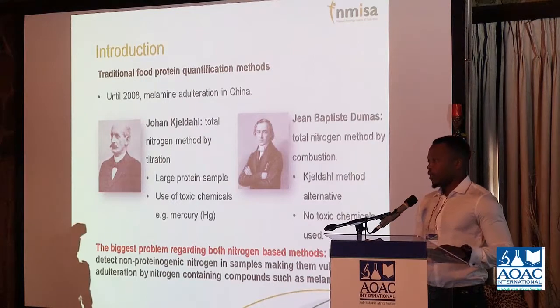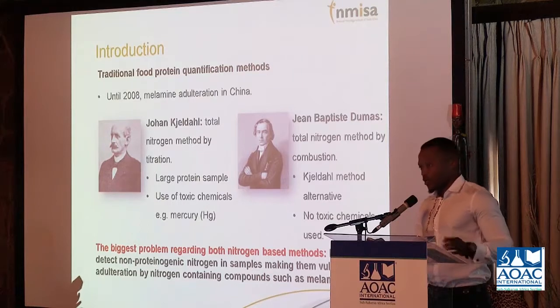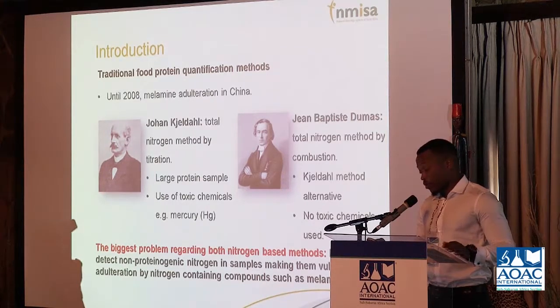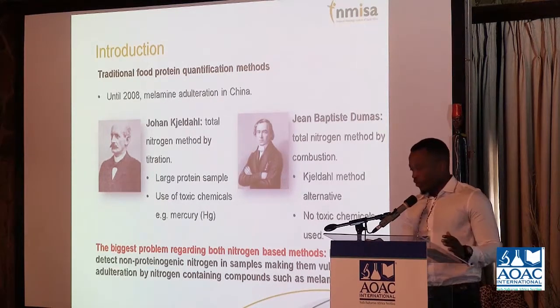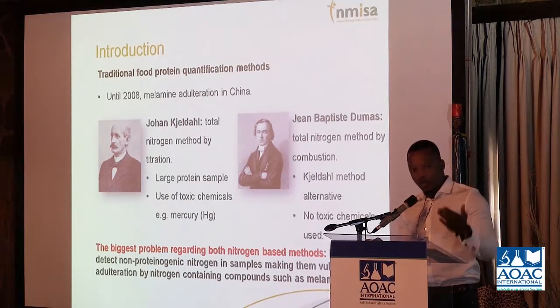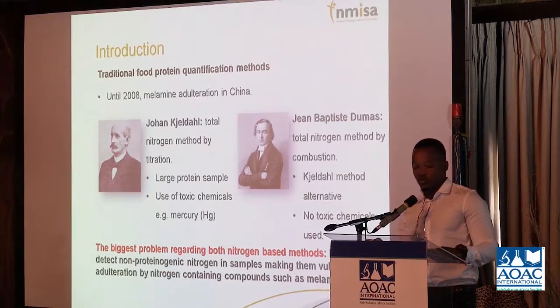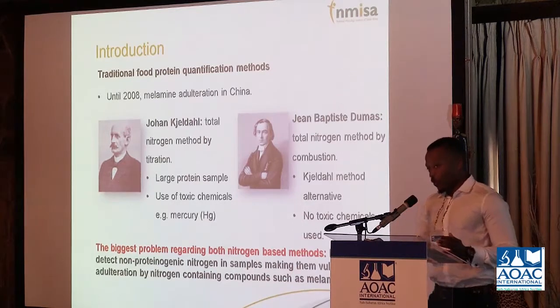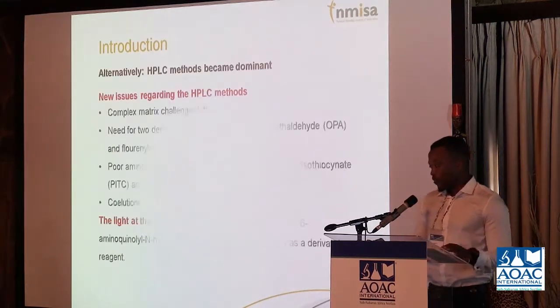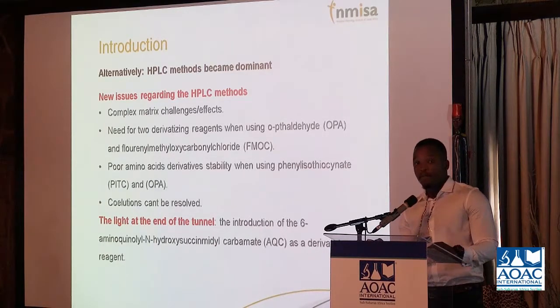With that said, this raises an issue with respect to the presence of non-proteogenic nitrogen in the sample. So these methods failed to actually distinguish between the proteogenic and non-proteogenic nitrogen in the sample, which means we had to find viable alternatives. So with this problem, HPLC-based methods became very dominant.